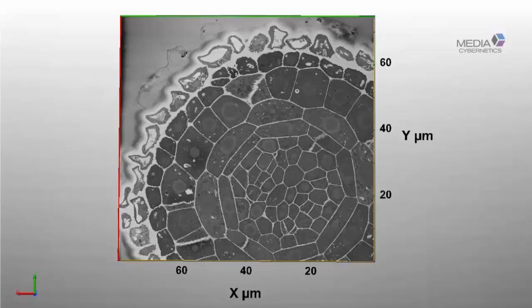But again, this just shows and highlights being able to take that stack, generate your 3D rendered volume, do your analysis, and then make a movie for, again, presentations, whatever you need that movie for, but to demonstrate that particular experiment.